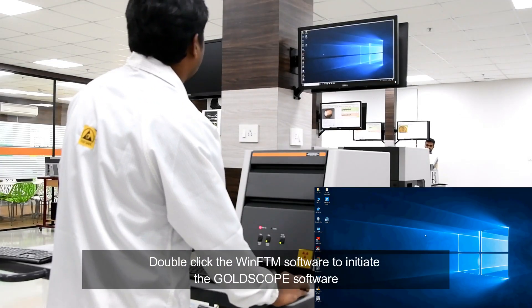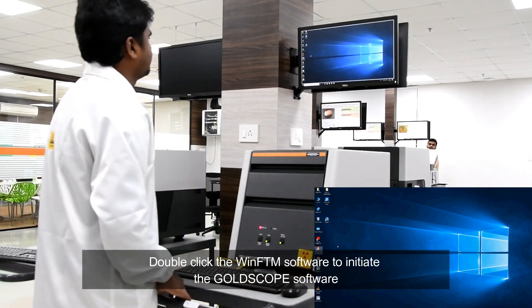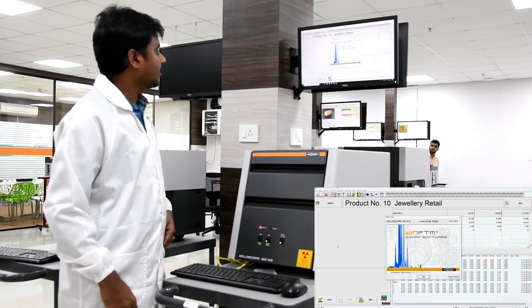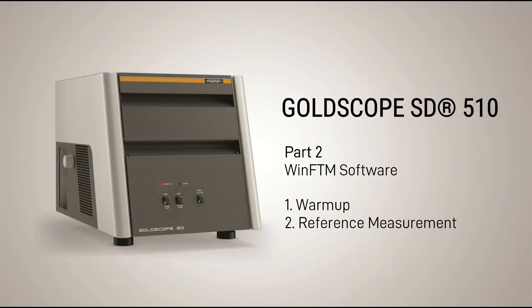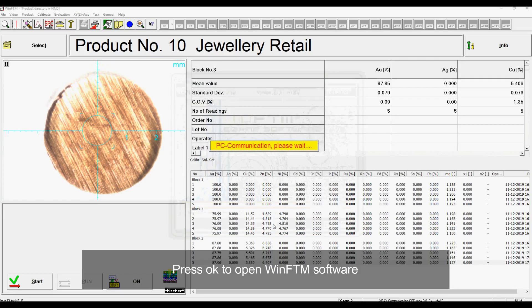Double-click the WinFTM software to initiate the Goldscope software. Moving on to WinFTM software where we will cover the warm-up procedure and reference measurement. Press OK to open WinFTM software.